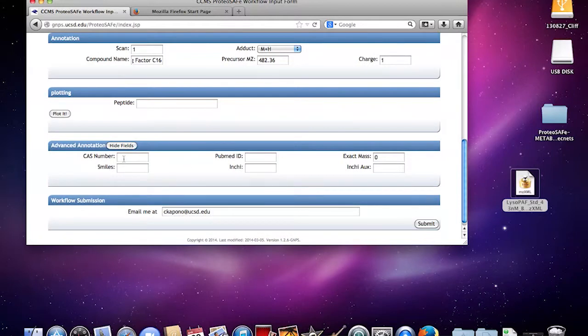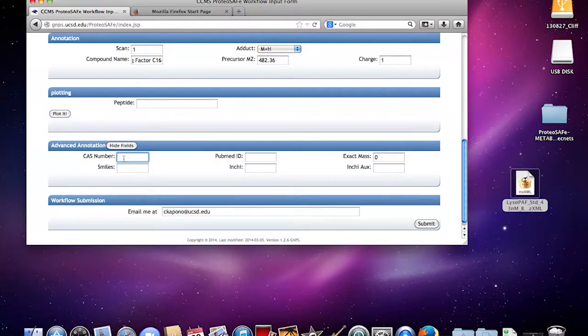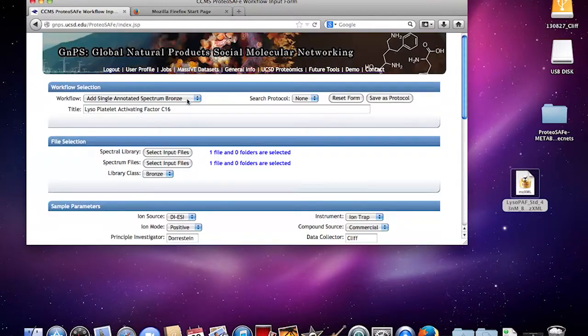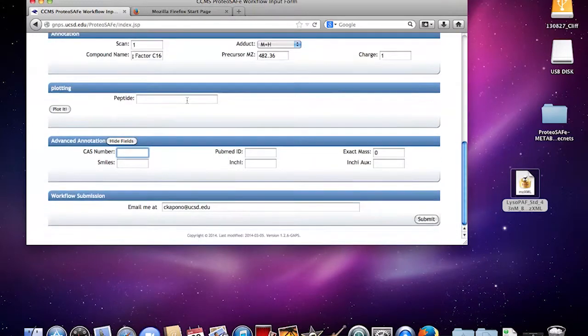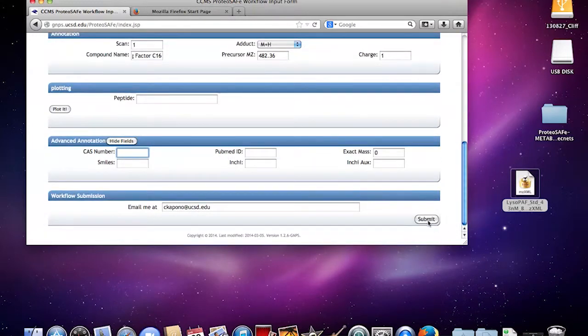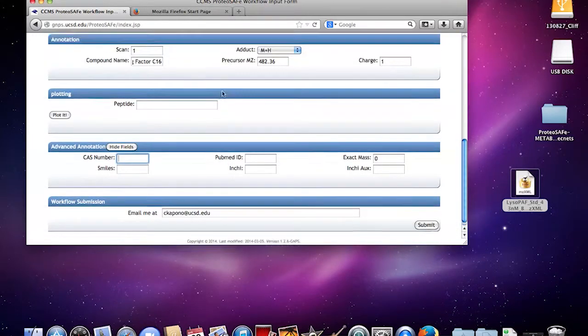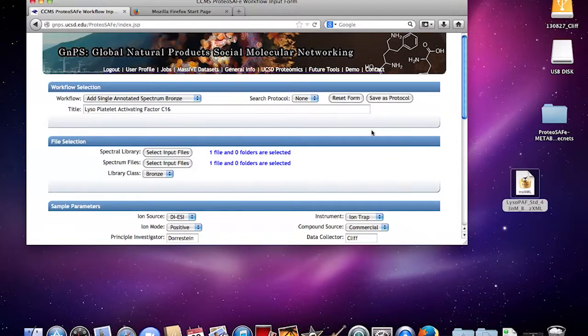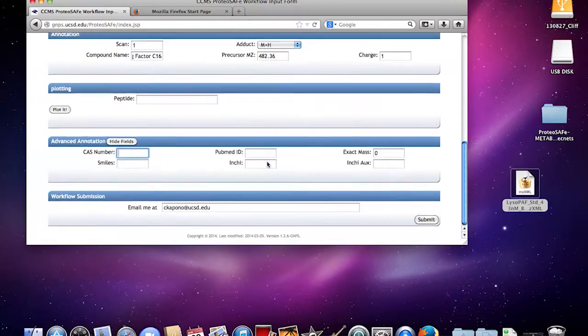What you're going to want to do in your advanced fields, at the bare minimum you want to include this CAS number. So we can not just validate your upload but also make sure that the molecule you're saying you're uploading is actually correct.